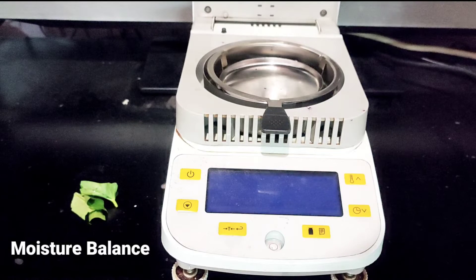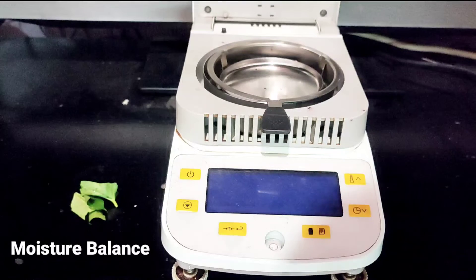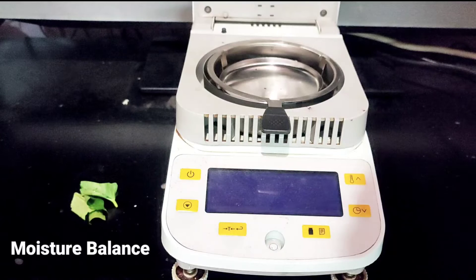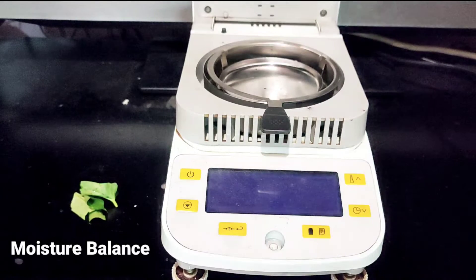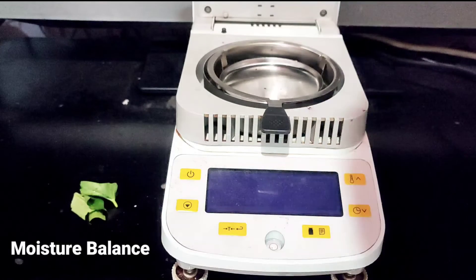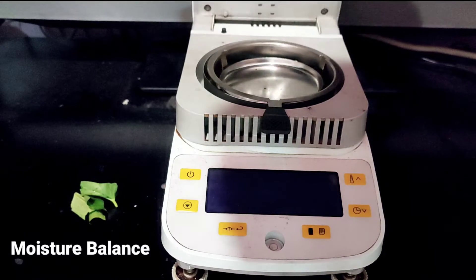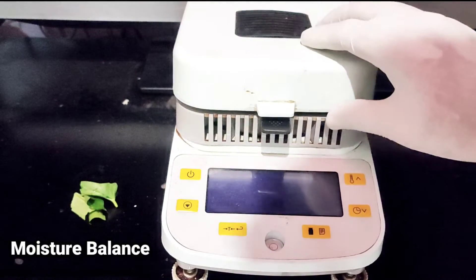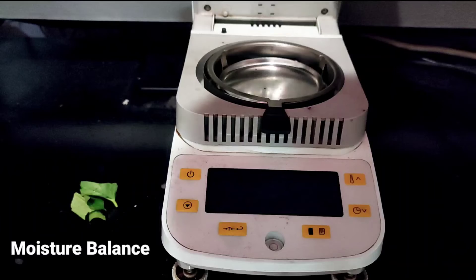Selamat siang. Kali ini saya akan menjelaskan satu alat dari merek Biobase Moisture Balance. Untuk pertama, kita connect dulu untuk colokannya, soket 220 nya. Dan untuk cara pemakaiannya, ini bisa ditutup. Ini kita buka.